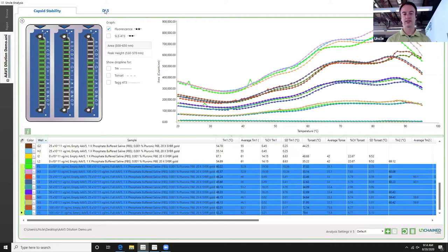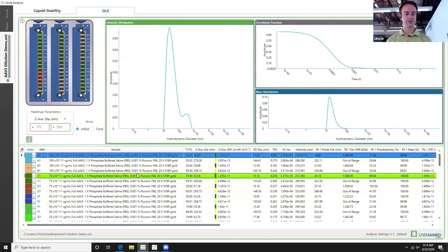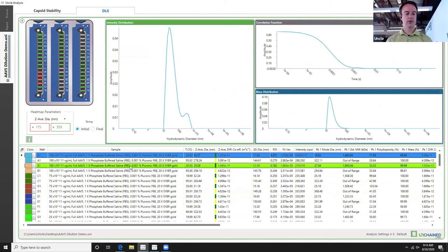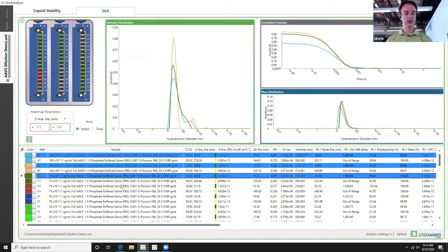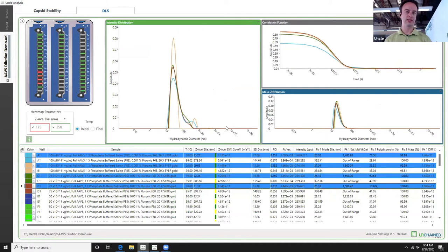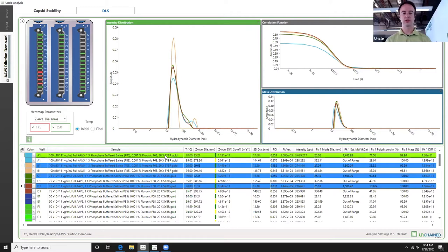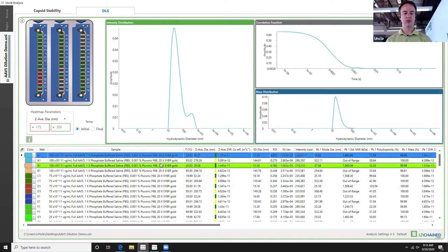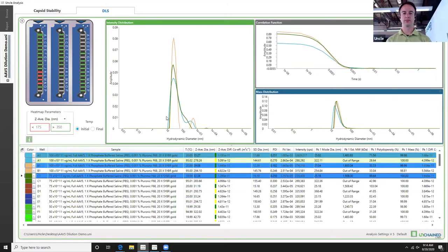Now let's take a look at DLS and get an understanding of how that can be used. We can look at our dilution series of capsids and see that most of these capsids are around the order of about 30 nanometers in diameter, but we do see some aggregation in this sample. That's for us to understand how much that aggregation is going to impact results. In this case, we know these results are going to produce pretty trustworthy data. That's a look at AAV data on UNCLE using the viral toolbox.